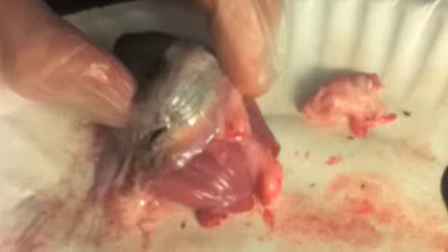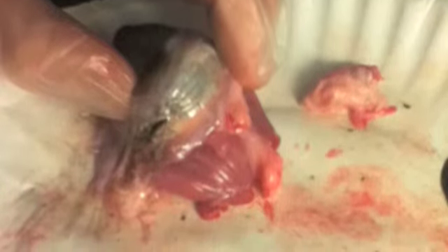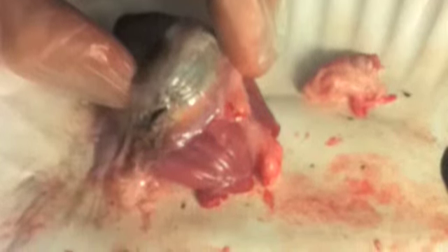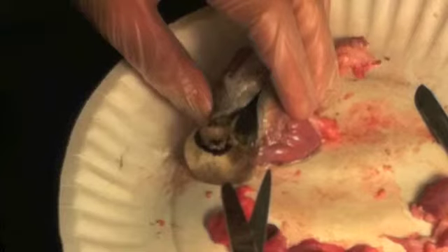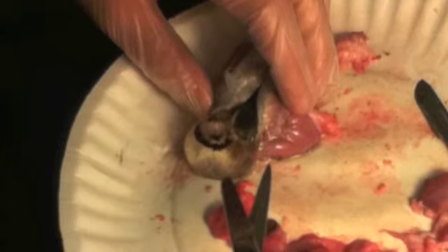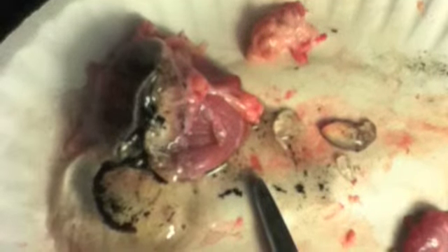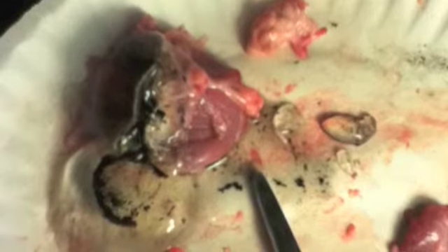Next, we want to cut through the sclera to gain access to the other parts of the eye. We start by making an incision on the side towards the middle of the sclera, and we continue this all the way around until we have the cornea in the bottom of the eye. A jelly-like liquid called the vitreous humor may flow out of the eye, but if you're lucky it won't come out and will stay on the bottom. It holds the eye together and gives its shape, and is made of mostly proteins and water.